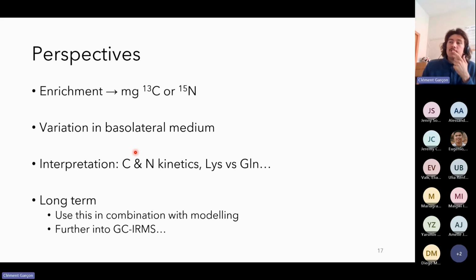Yeah. Well, the values were corrected for the natural enrichment, but it's more that we look at the movement of 13C and 12C. For example, if the glucose moves very fast, then a lot of 12C will move and disappear because the cells absorb the glucose and use it and catabolize it. So then we have less 12C. Then the enrichment in 13C, for example in the apical medium, will increase, even though the quantity of 13C decreases also a bit, but slowly, because the cells use it a bit slower. So then you don't see a decrease in enrichment. Okay, interesting. For the in vivo part, I'll ask you next time. Okay.